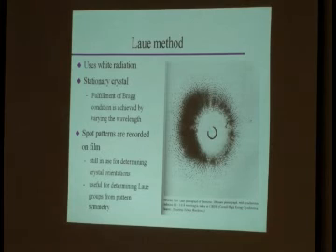Then we record a spot pattern either on film or on some kind of an image plate or CCD nowadays. And this is still useful because what you see in a Laue pattern is certain symmetry elements. You see rotations and you see mirrors in Laue patterns. So, anything that has translations you can see through systematic absences. The non-translational symmetry elements, rotations and mirrors, you can see in Laue patterns. Okay? Somebody once asked me, how do you figure those out if you only see the ones with translation? Here's a method to get to some of them, okay?